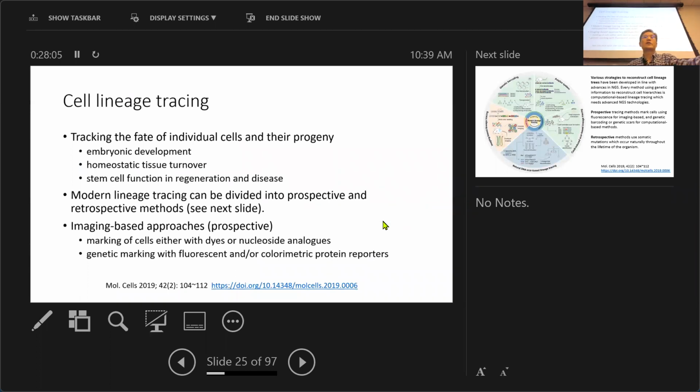If you don't have a question, we will move on to pseudotime analysis. People are always interested in cell lineage tracing, especially if you study development or differentiation processes. The most direct example is you want to study embryo development at different time stages.